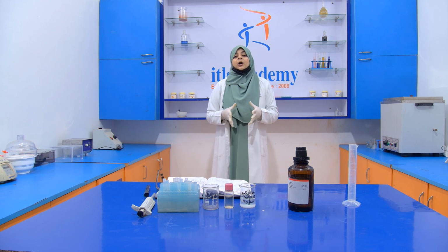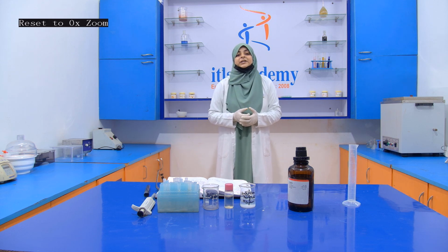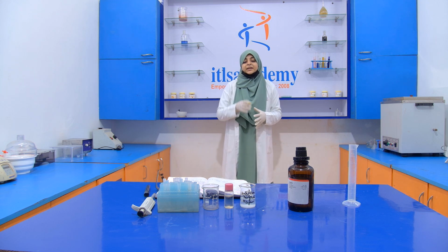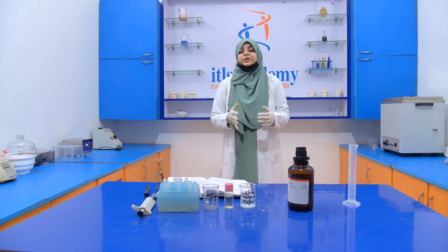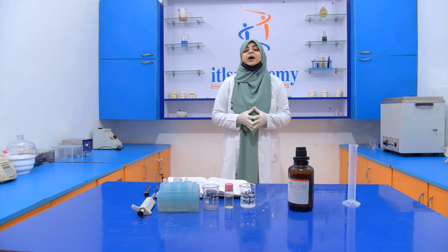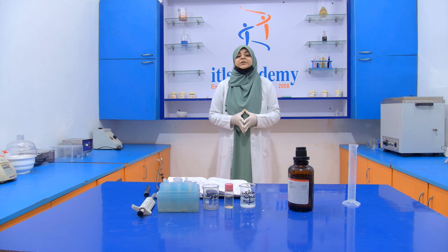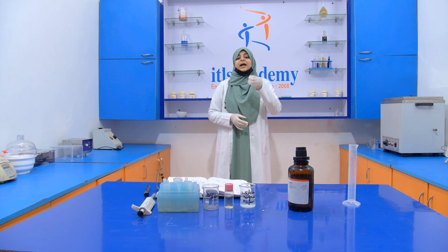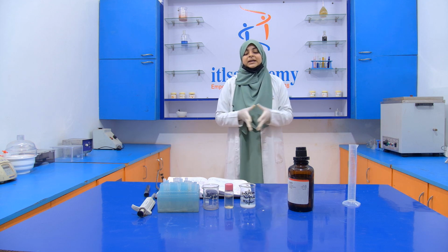When handling concentrated sulfuric acid, we have to take extra care. We have to wear proper gloves and a proper mask when preparing this chemical, because concentrated sulfuric acid may damage your skin and eyes and burn your skin. You must not inhale the vapors which come out from the bottle of concentrated sulfuric acid, otherwise it will damage your respiratory tract and also cause irritation inside your digestive tract if it reaches there.